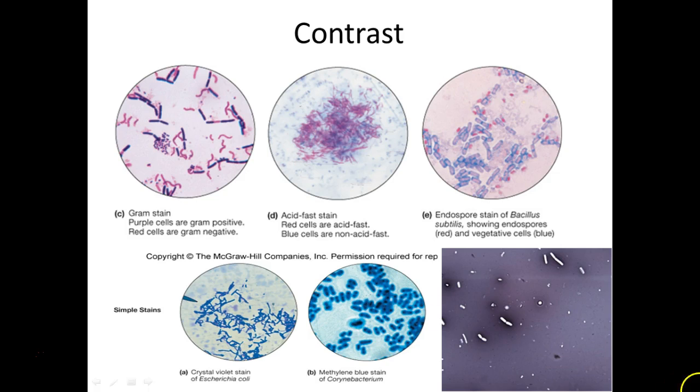This is also a single dye, but in this case, the background is stained and not the cells. So the cells are clear. These are actually the bacteria cells, these little rod-shaped guys. This other stuff is literally probably dirt on the slide. Little specks of dirt. So that can be difficult for people sometimes too, right? What am I actually supposed to be seeing? What do bacteria look like? So getting yourself oriented.